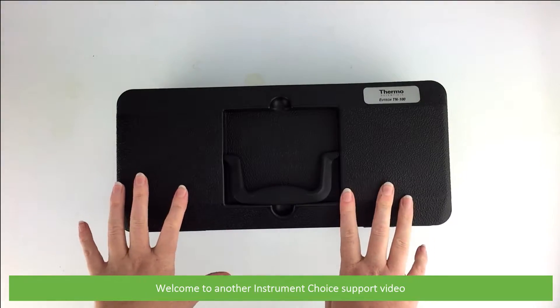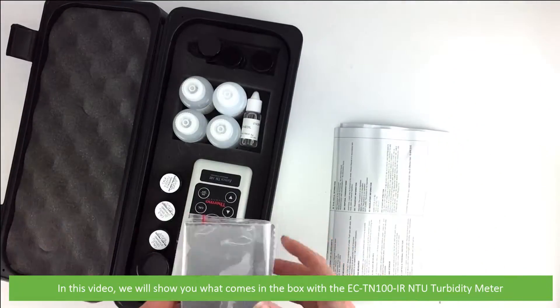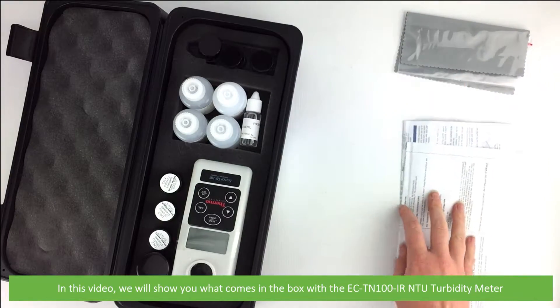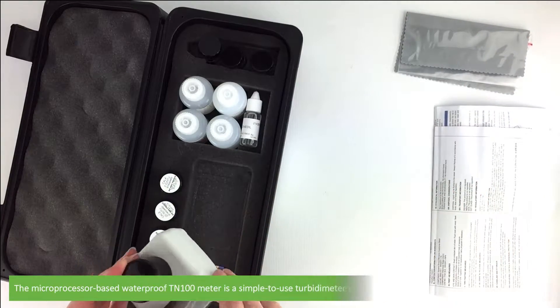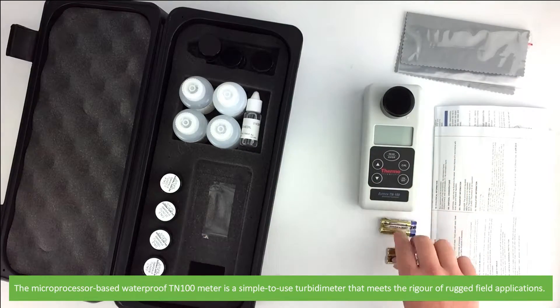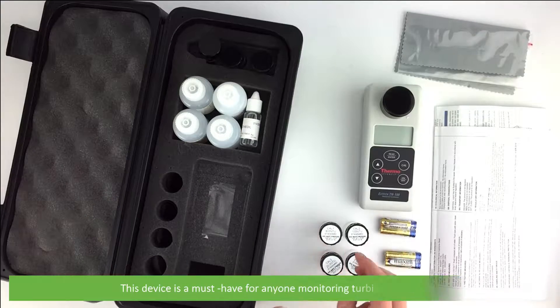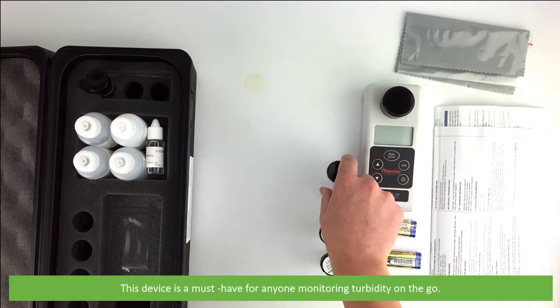Hi and welcome to another Instrument Choice support video. In this video we'll show you what comes in the box with the EC-TN100IR NTU turbidity meter. The microprocessor-based waterproof TN100 meter is a simple to use turbidity meter that meets the rigour of rugged field applications. This device is a must-have for anyone monitoring turbidity on the go.